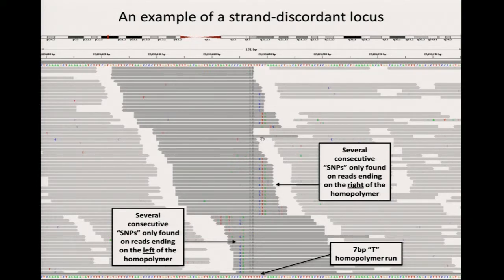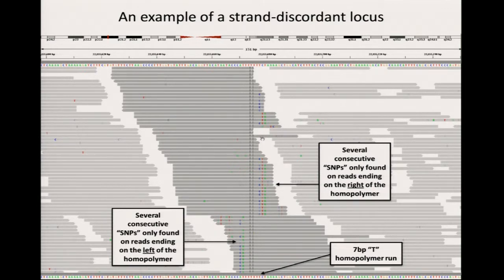Here is an example of these artifacts. In this pileup of an example region of the genome, you can see a homopolymer run. Some reads support the presence of SNPs just after the homopolymer, and other reads support SNPs just before it. The reads supporting SNPs on one side tend to be mapped in one direction, and those supporting SNPs on the other side go the other direction. You don't expect a dependency between read orientation and the presence of SNPs — it's an indication of a problem.